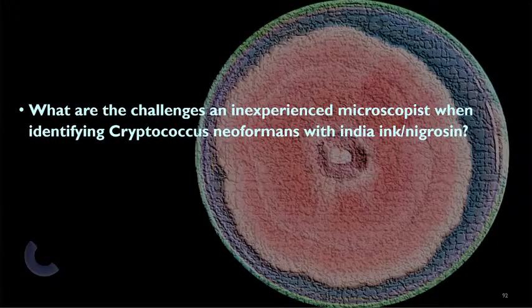Alright, so Nigel, kaka-graduate mo lang, ano yung mga challenges na pagdadaanan mo when you're identifying Cryptococcus neoformans with India ink or nigrosin? So tingin mo, ano yung mga pagdadaanan mo? Nakapag-microscope ka na ba in general? Wait lang ha. Tanungin ko muna kayo. Yes or no? Nakapag-microscope ka na ba?